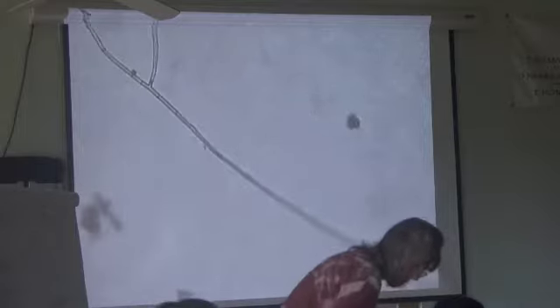Well, because the diameter of fungi has to be 2 or greater. And so when you can't really see any space in there, you're dealing with a very narrow diameter. And now, what is the diameter on this thing? Well, go find your littlest bacteria and you realize that this is that diameter. So this is too narrow to be a fungus. It has to be an actinobacteria. But that's a pretty good way to determine. If you can't see any space between one side and the other, it's got to be real narrow. Can actinobacteria branch? Yes, actinobacteria can branch.